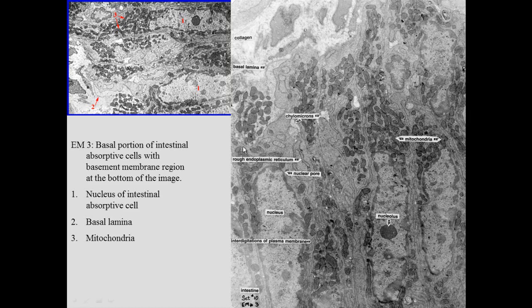But here we can see individual cells, the base of the cell, lots of mitochondria. So this is one cell right in through there, and here's its nucleus. And the nucleus has euchromatin, which is light staining, and then on the edge we see heterochromatin. And sometimes you might be able to see nuclear pores. But these are all mitochondria of different cells. So the host of different cells there, mitochondria at the base for transport at the bottom.